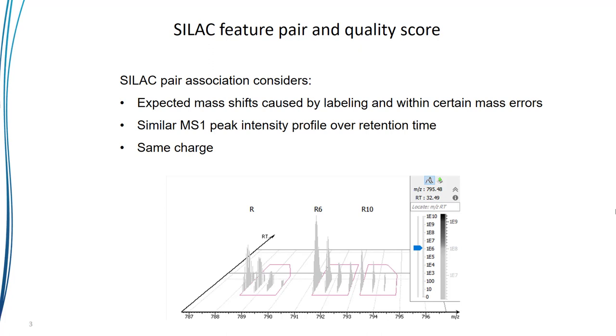Considering this information, SILAC feature groups are accurately found. These details are also used to generate a quality score for each peptide.